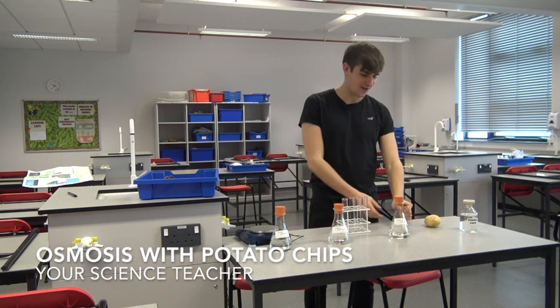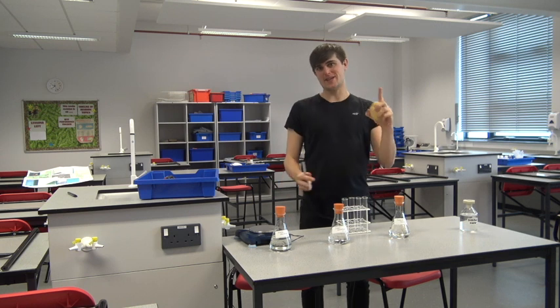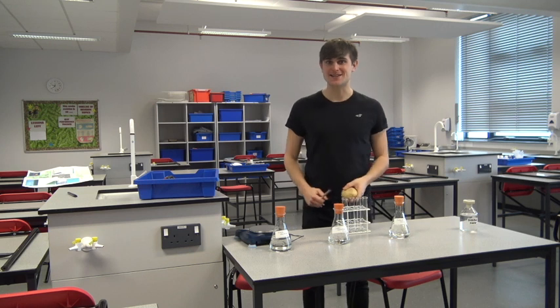This practical starts off using potatoes and we're going to see how water moves in and sometimes out of the cells of a potato.